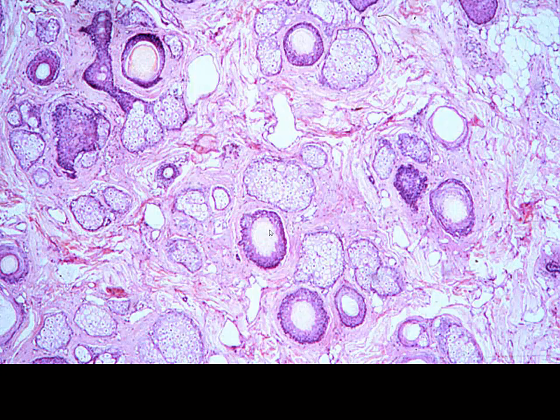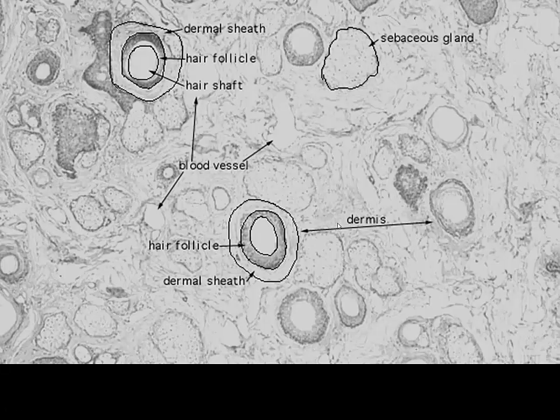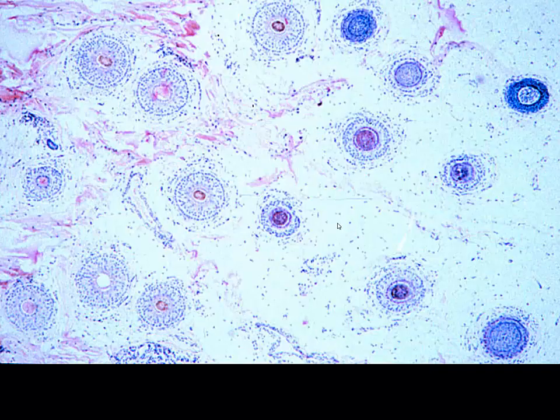There we can see our hair follicles in cross section, the matrix of the hair, the follicular cells, glassy membrane is going to be out here, and then here are all of our sebaceous glands. We don't really see them necessarily attaching to hair follicles. You might imagine an attachment there. This, I'm not exactly sure what that's attached to. Trying to find other attachments, but most where you find a hair follicle, you're going to find the associated sebaceous glands. And again, just more cross-sectional looks at hair follicles.